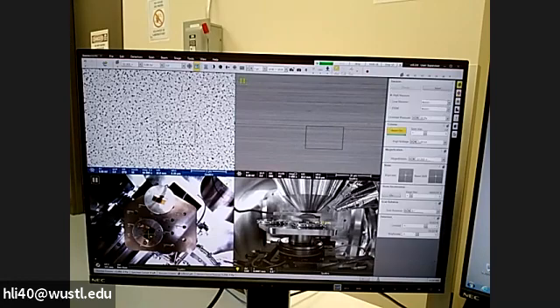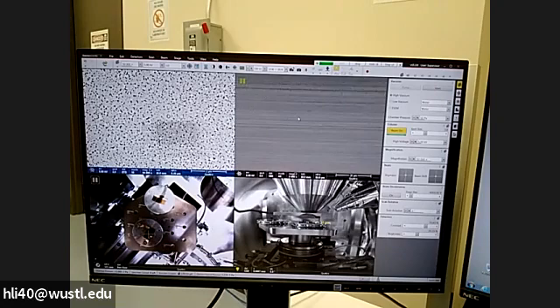Also, the stigmator, this is the place you want to change. And again, it's good practice to make sure the beam shift is zeroed. Sometimes we do use a beam shift, and when we go to very high magnification, we just use the beam shift to move the sample or the place to the center of the screen, or to the place we like to take an image. We do use image shift. If I drag it, you will notice it can move. So if you use that, click the zero button to neutralize it. Yeah, you can record the photo after you change.